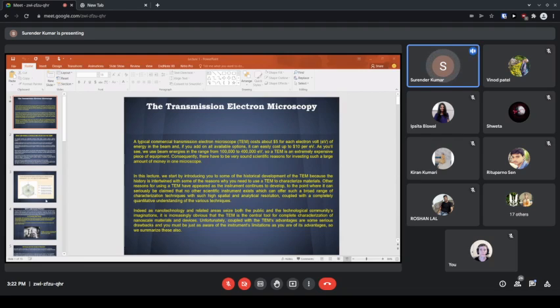And also today we have cryo-electron microscopy, where most electron microscopes are operated at room temperature, but for biological samples you can go down. Liquid nitrogen temperature is very common. So we call it cryo-electron microscopy.